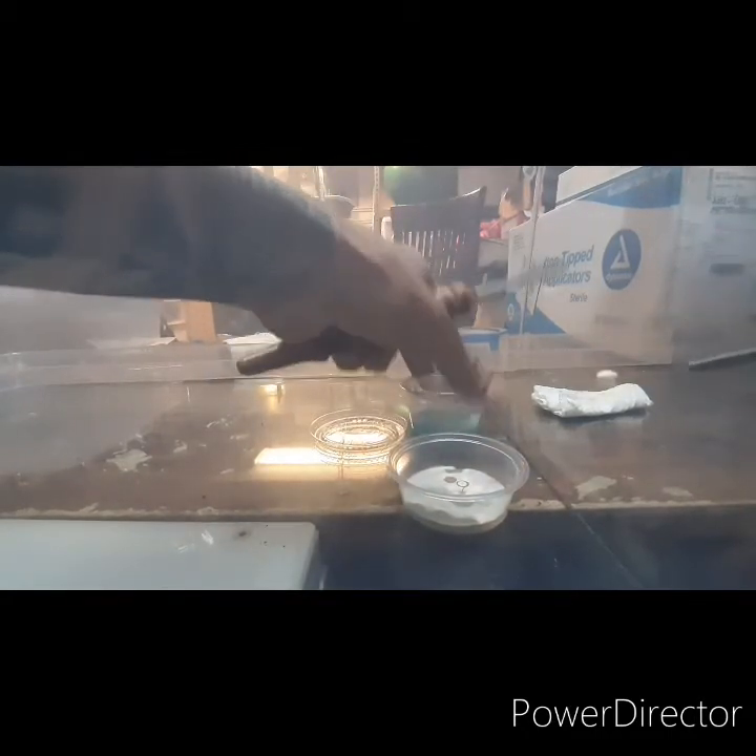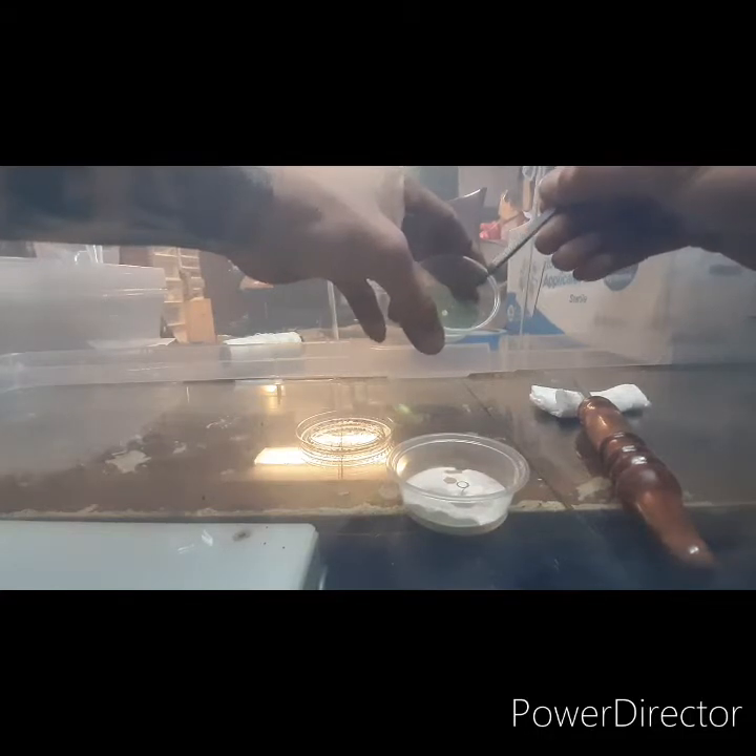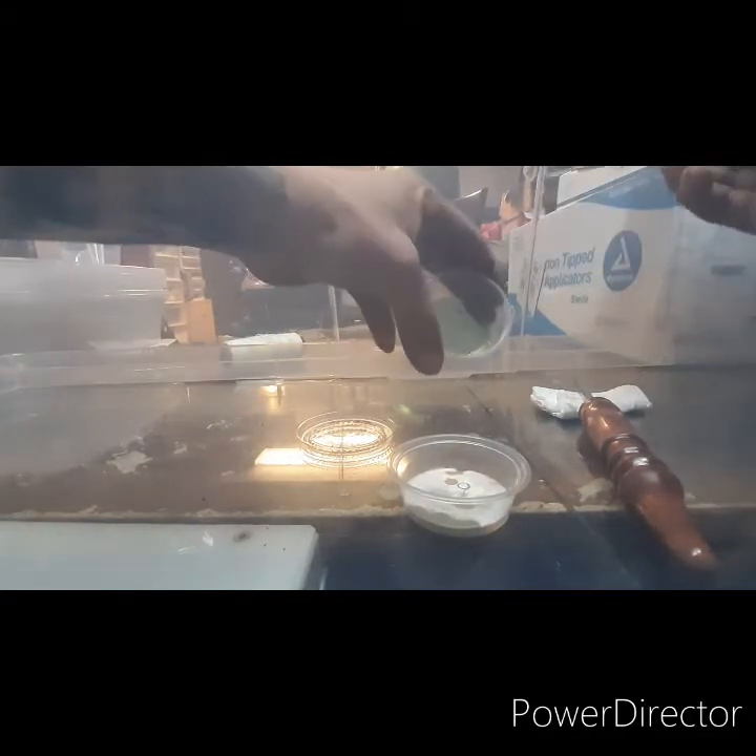Perfect example — you got one stuck, which doesn't happen very often. You just stab it and place it. I'll lift it up so you can see it better. Yes, that's a piece of contamination in here too, but that's if it gets stuck.